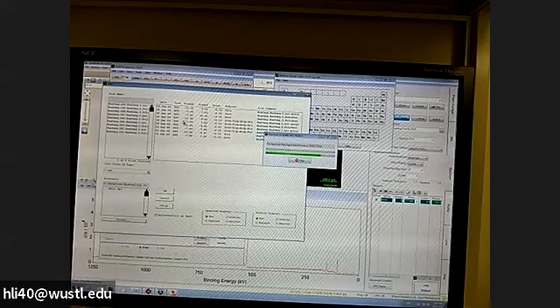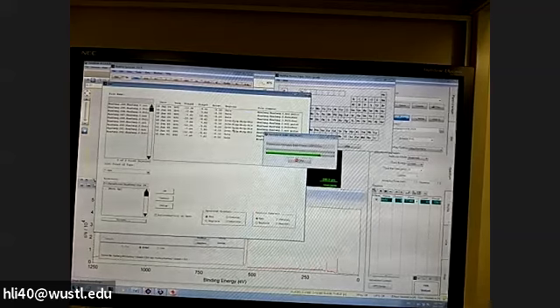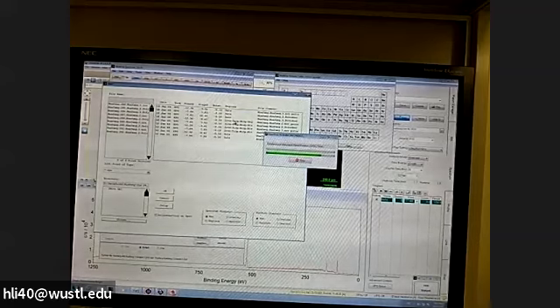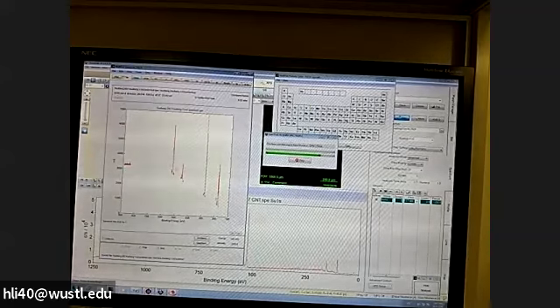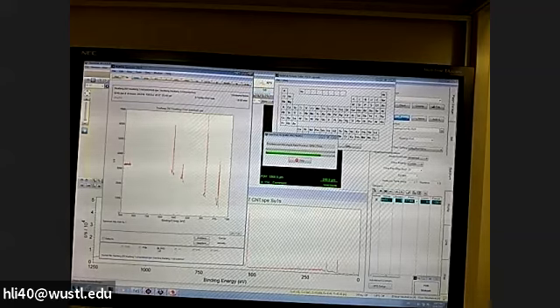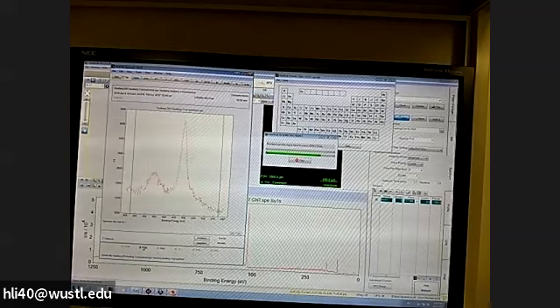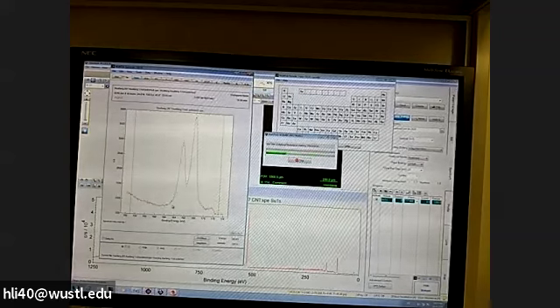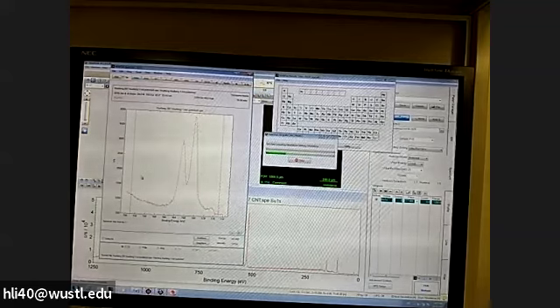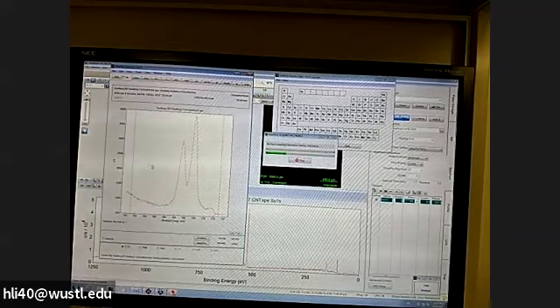Okay. So for example, now we have so many spectra. You can open and find one spectrum. This type of spectrum is fine scanning, so you can see it's much smoother. So maybe we see titanium, maybe. For example, this zirconium. For the zirconium, if we want to, you see obviously the two peaks here. If you want to do fitting, you click fit.